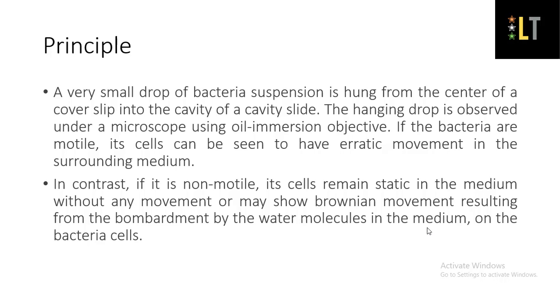So if the bacteria are motile, the cells will be seen to show erratic movement in the surrounding environment, and if the cells are non-motile, then they will remain static in the medium without any movement, or may show Brownian motion resulting from the bombardment by the water molecules in the medium on the bacterial cells.